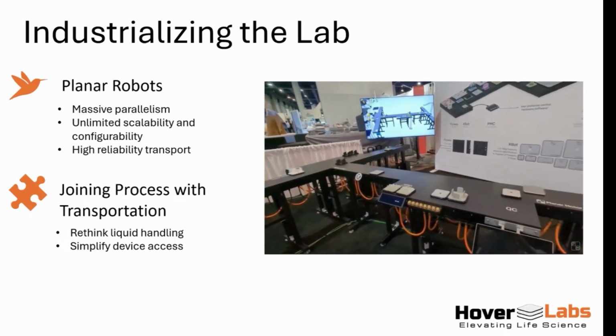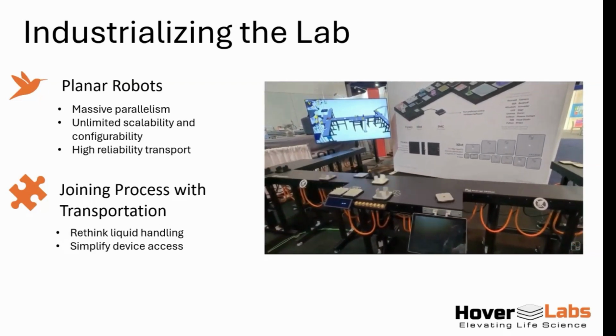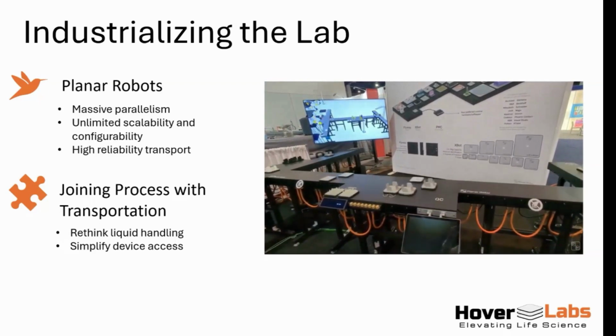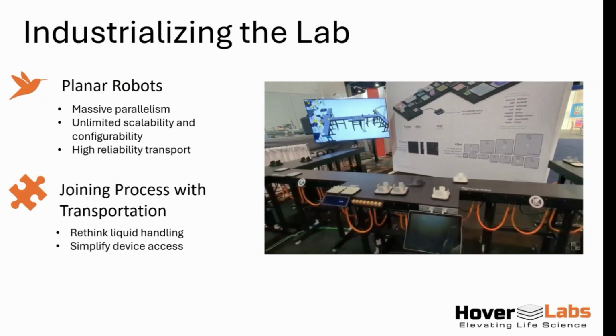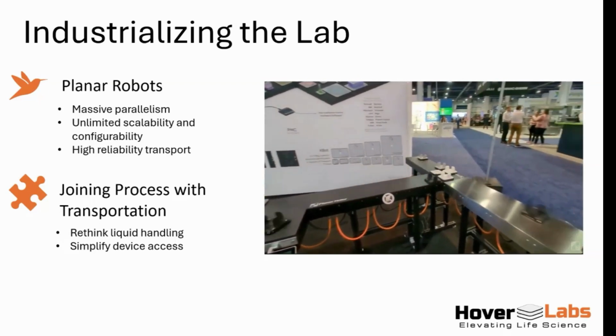So we have to rethink how liquid handling is done and how scientific devices are accessed. By redesigning pipetters, reagent dispensers, and plate handlers as planar robots, samples can drive right up to them without the need of an external arm. Next slide, please.